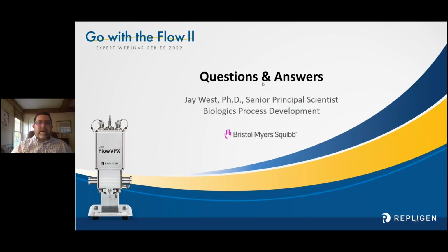So I'm taking a roundabout way to answer the question, but the initial instrument development and the trial of the technology was done in process development, and process development analytics specifically. And then we successfully demonstrated this technology.